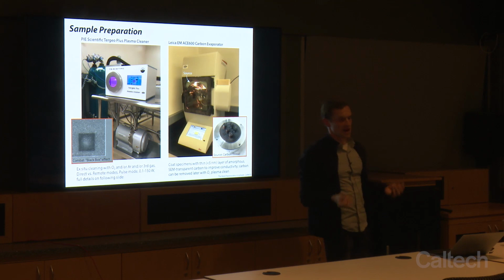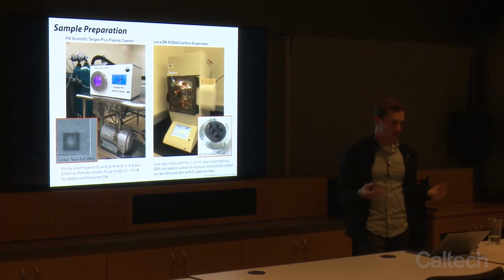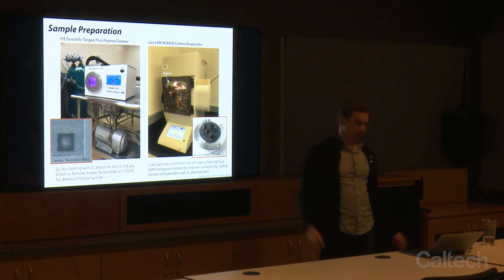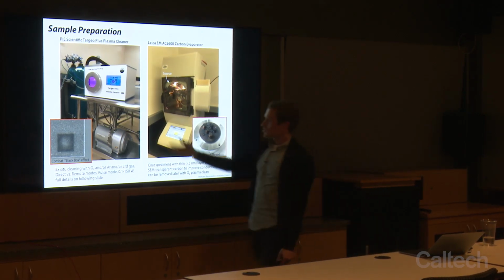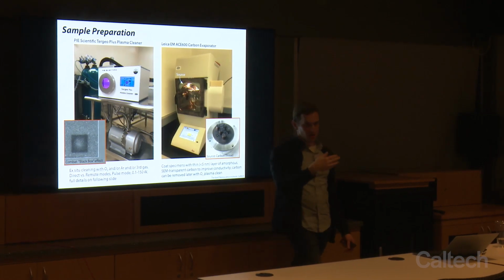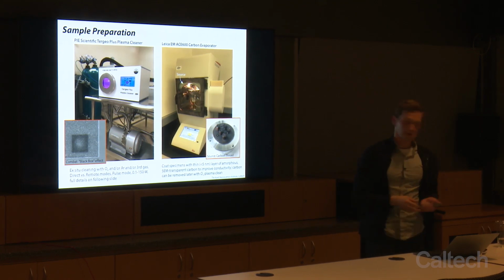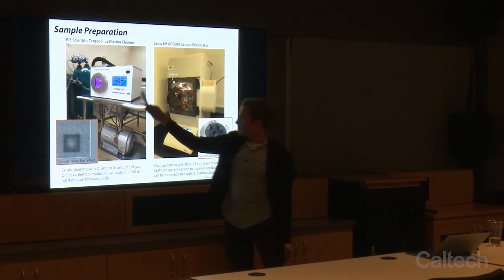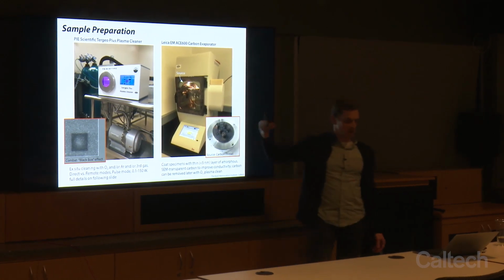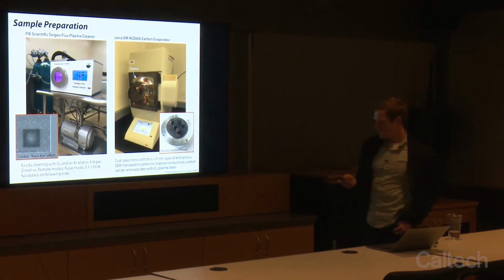And carbon doesn't have a high secondary electron yield, so it ends up looking darker. So you get carbon coating your sample, and then you get these black boxes. So what you could do is put your sample in an oxygen cleaner, oxygen plasma, remove the carbon, and therefore when you go and make your images, you won't have these black boxes. And you should be able to actually remove this carbon with that oxygen plasma if you want to recover the functionality of your device after imaging it.